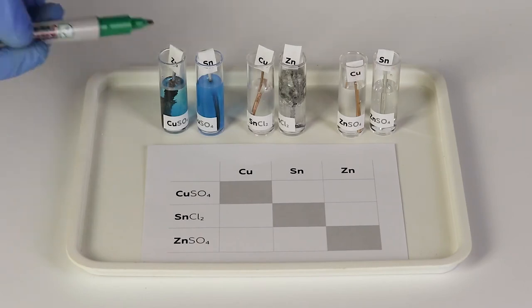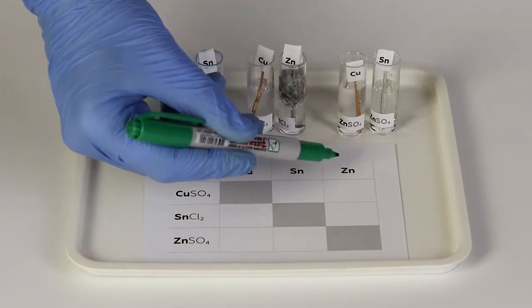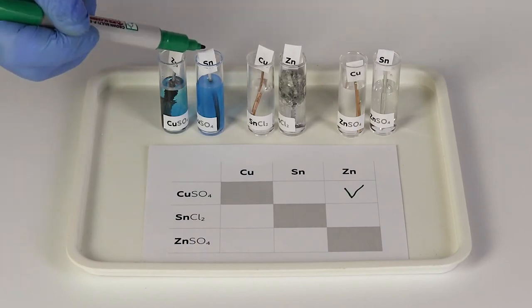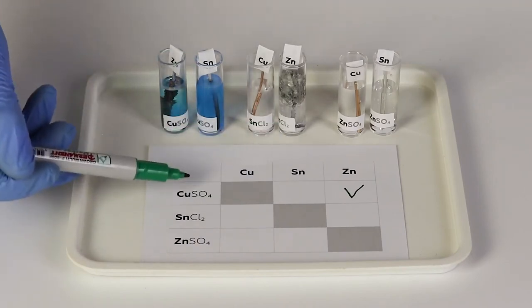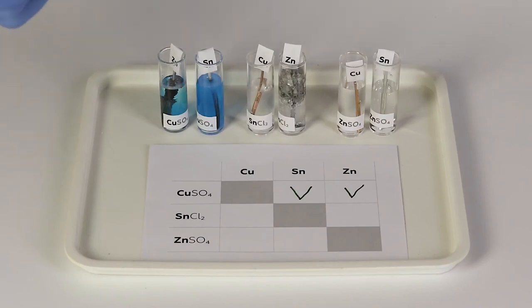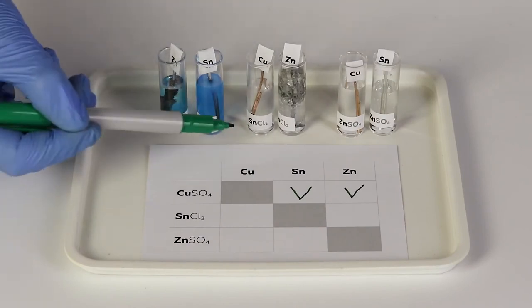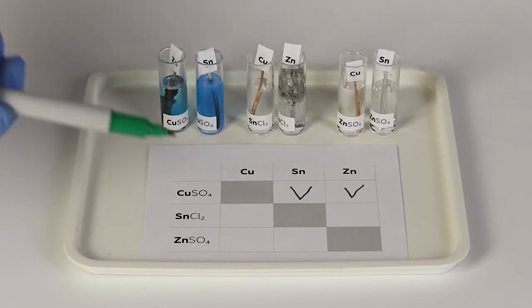You will observe that zinc and tin react with the solution of copper sulfate. They form zinc and tin sulfates and metallic copper. You will observe that zinc reacts with the solution of tin chloride and forms zinc chloride and metallic tin.